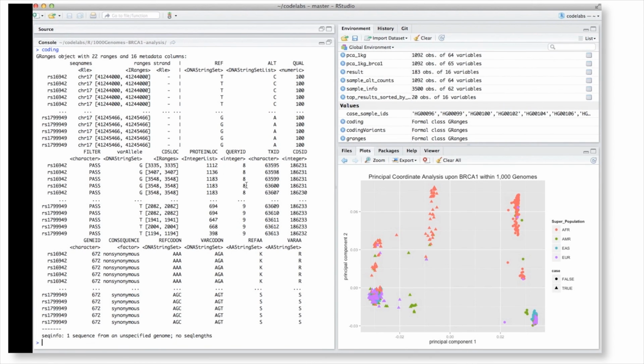There's a ton more that we can do with BioConductor, but we haven't actually yet answered our original question about the clusters. So a question for our users who have much more experience in this domain: what should we examine next to determine the potential explanations for the clustering we saw over here for BRCA1? Send pull requests or GitHub issues. All ideas are welcome.